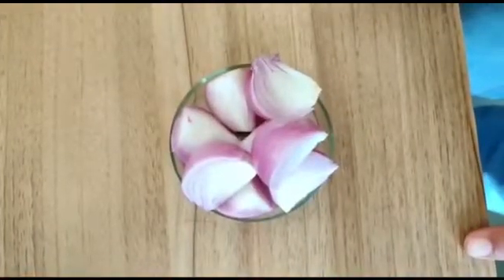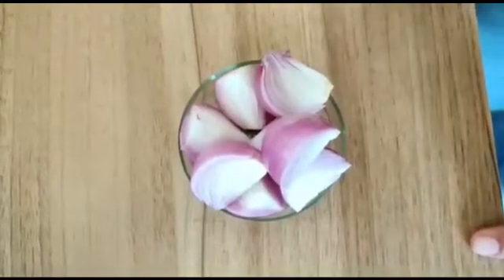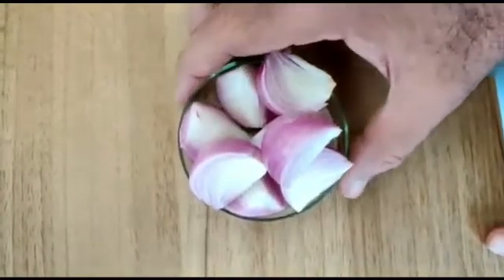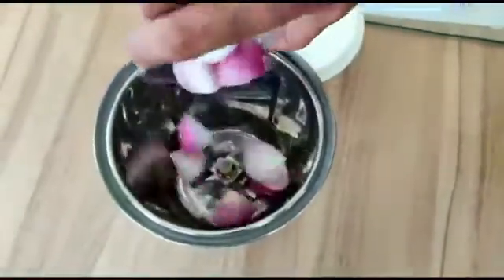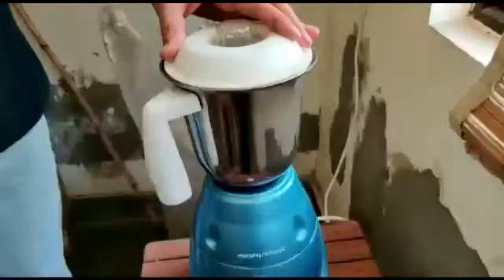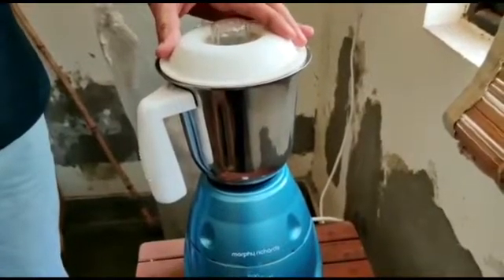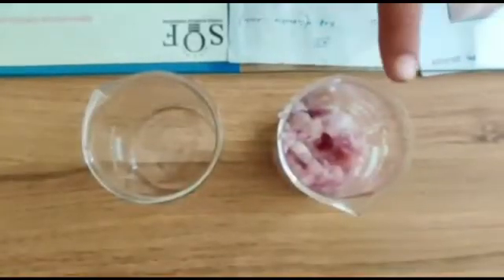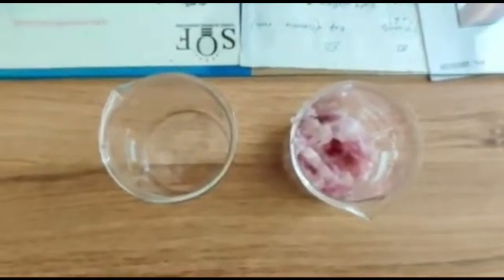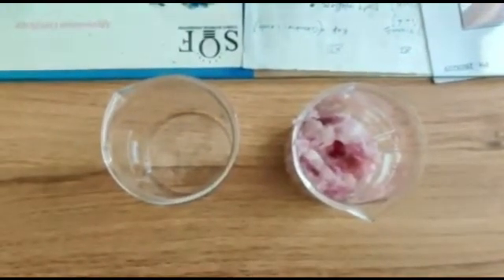First, we cut the pieces of onion and then put all these pieces in a grinder. We will grind these onion pieces. This is ground onion. This is another beaker in which we will prepare the extraction solution.